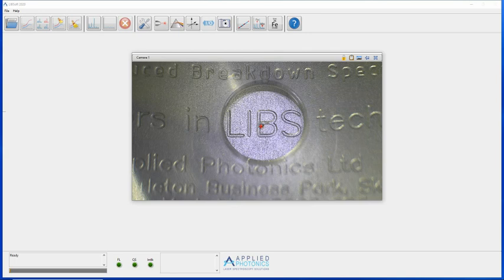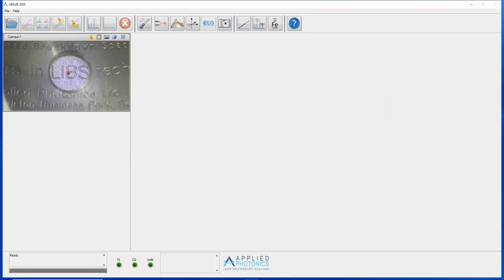To return a display window to its pinned position, simply click the pin icon again. The window will be resized and repositioned automatically. For a two-camera system, if both display windows are pinned, then the camera 1 window will be positioned above the camera 2 display window.